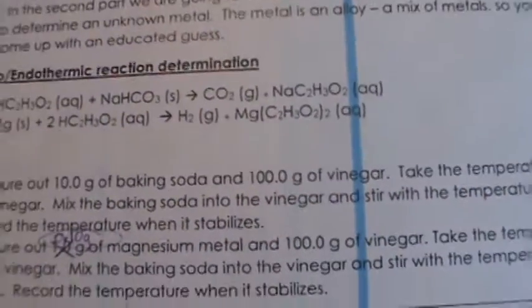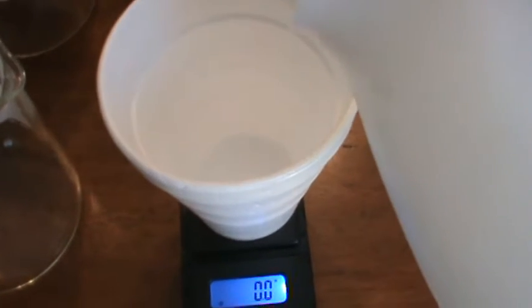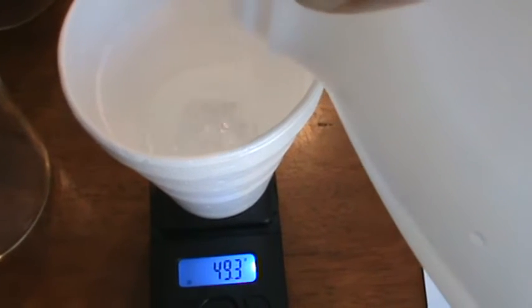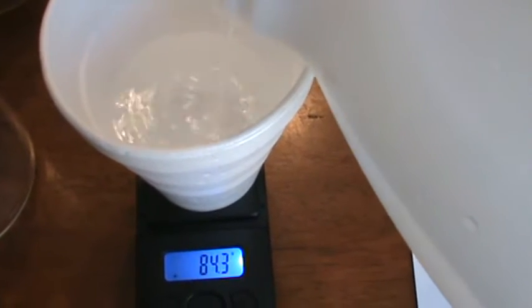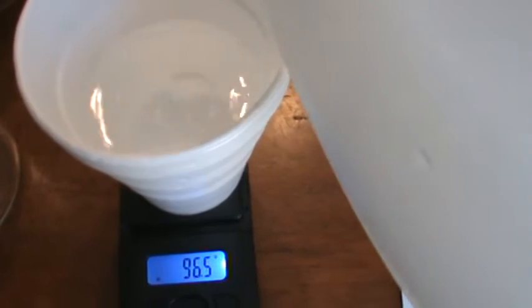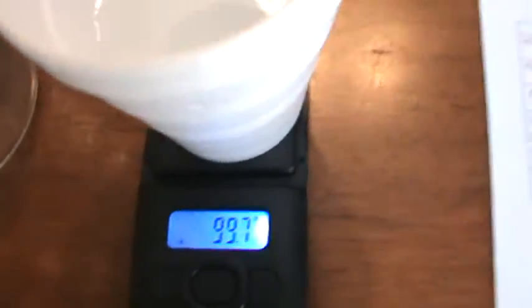So we're going to begin by measuring out 100 grams of our vinegar. All right, and we're going to call that good.